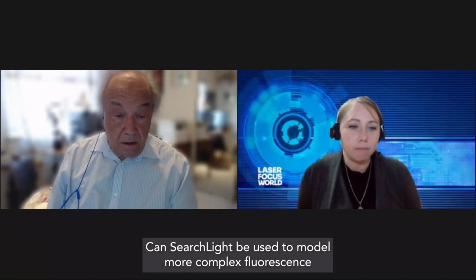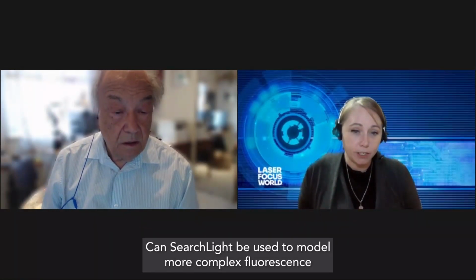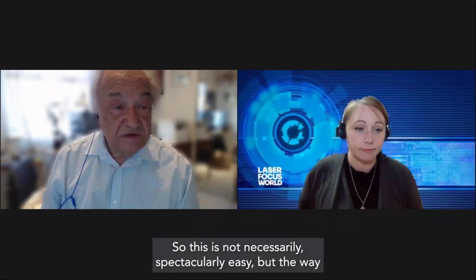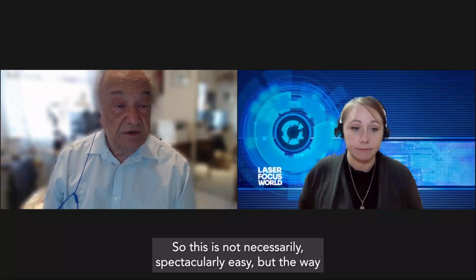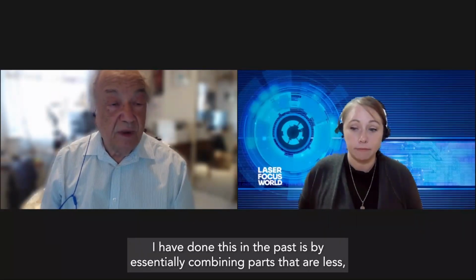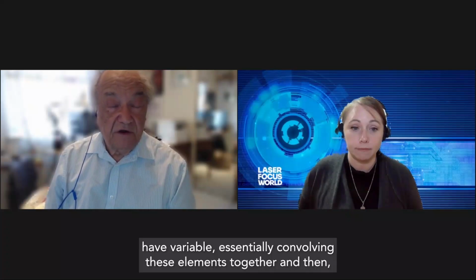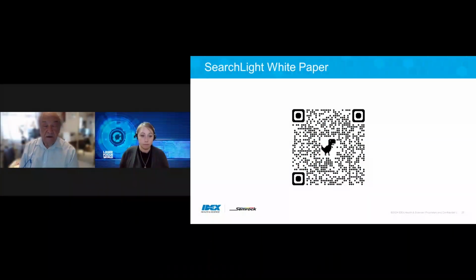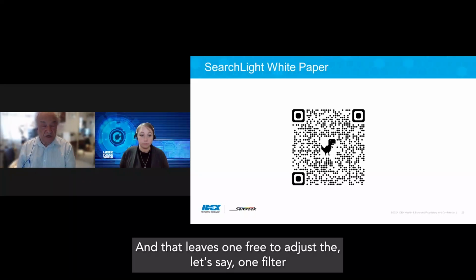Can SearchLight be used to model more complex fluorescence microscopes that have more than the minimum number of optical filters? Yeah, so this is not necessarily spectacularly easy, but the way I have done this in the past is by essentially combining parts that are less variable, essentially convolving these elements together, and then adjusting the ones that leaves one free to adjust the, let's say, one filter that is the most critical.